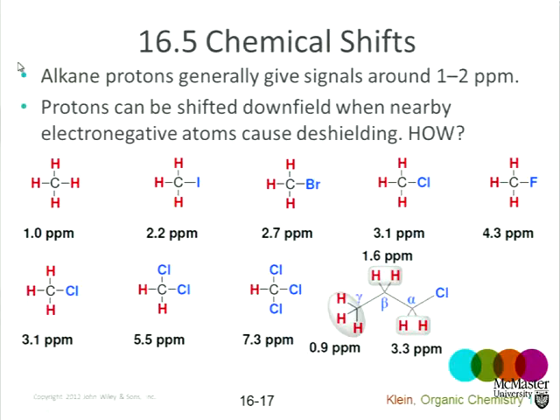Why is that? The carbon-halogen bond has delta plus on carbon, delta minus on halogen. Right? It has a dipole. And that dipole extends a little bit into the CH bond. So when I pull electrons away from carbon in an alkyl halide, the carbon responds by pulling a bit of electron density through the CH sigma bond away from hydrogen.